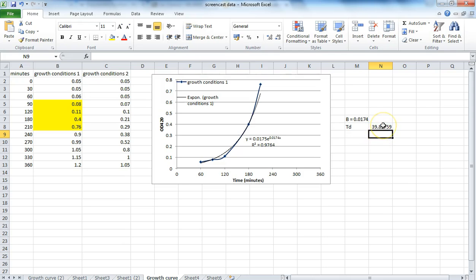In terms of lab reports, I don't think this needs to have this many decimal places. So you can think about how many significant figures you'd like it to be.